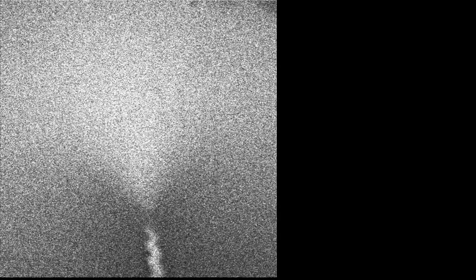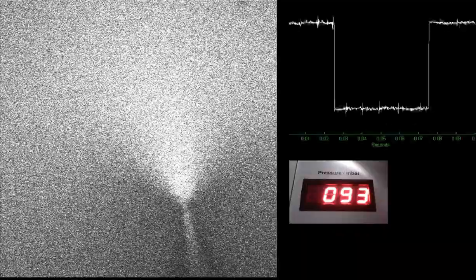The micro pipette is filled with a dye that is visible under the two photon microscope. The pressure or suction applied to the pipette is monitored. The pipette resistance is checked with a test pulse.